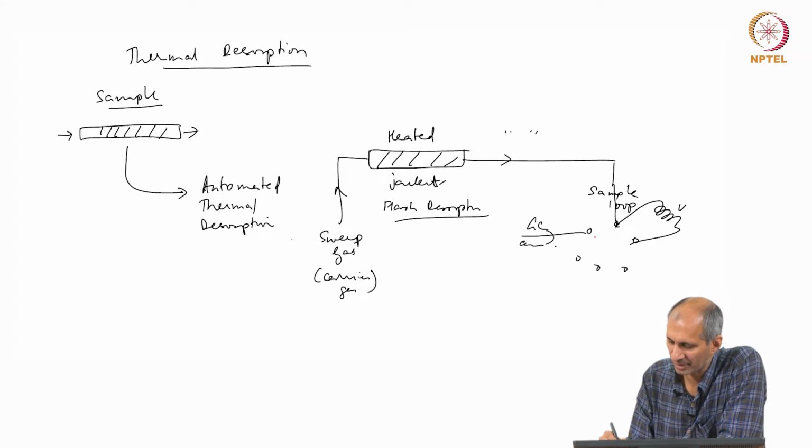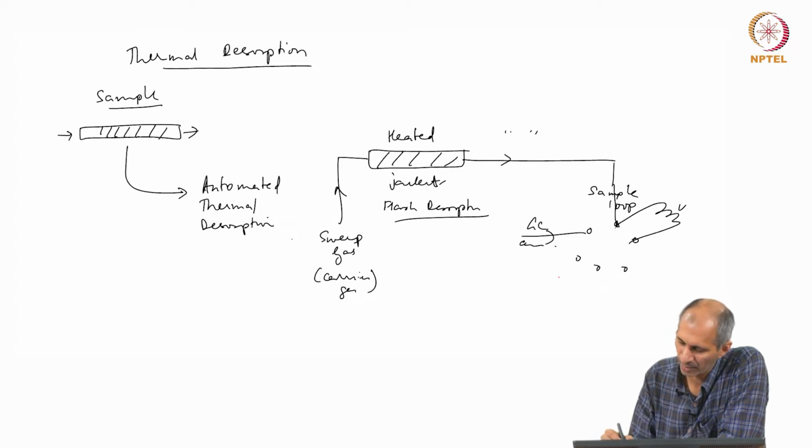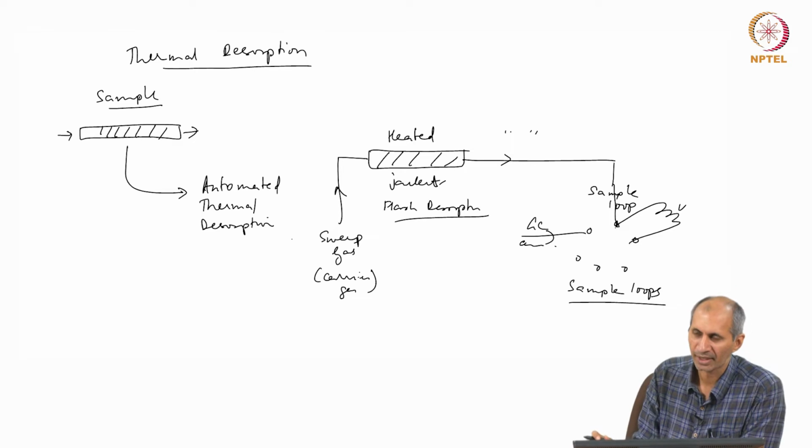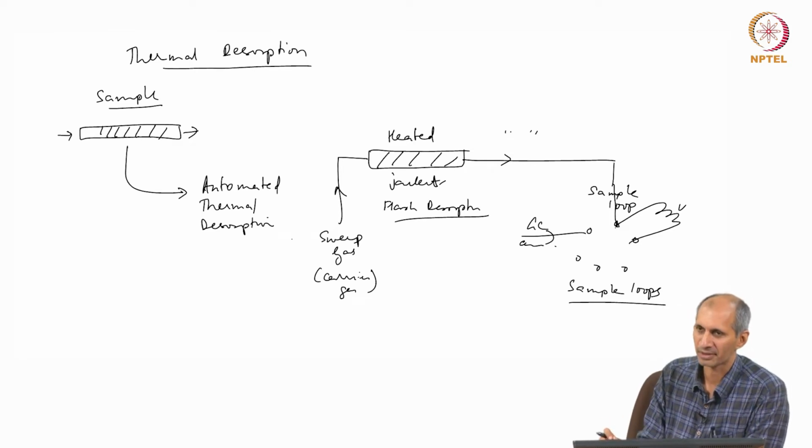So, there is a... I will not draw it here, we will just leave it like this. Go and read about sample loops. I will put it up out of the context here. So, it is possible to do it. People do it, and calibration now has to be done on this basis.